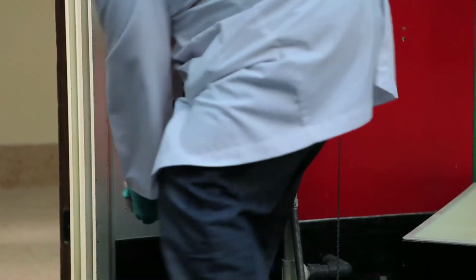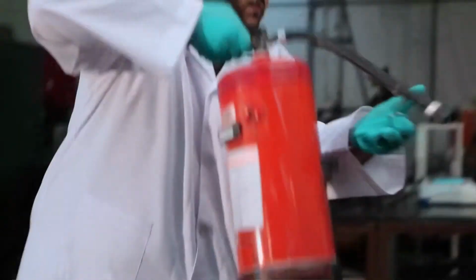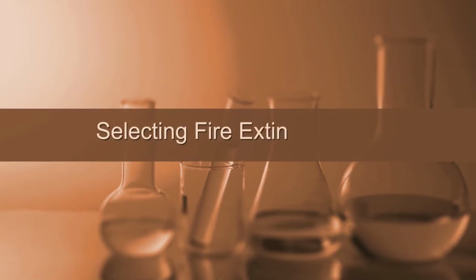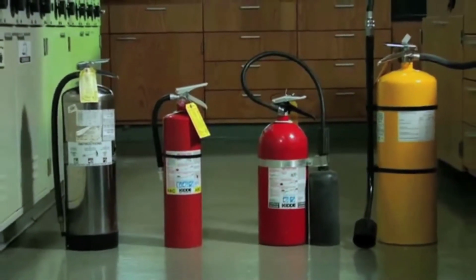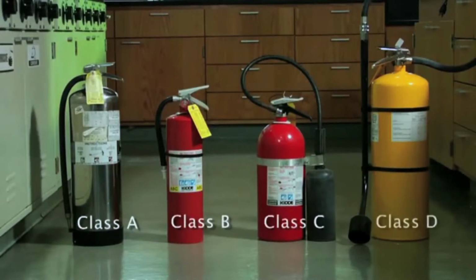Personnel working in lab areas should know how to use and properly identify a fire extinguisher appropriate to the material being handled. Keep your fire extinguisher accessible and clear of obstructions at all times. Know how to select a proper fire extinguisher. Fires are classified according to the material that is burning. The types of fire extinguisher used in a lab are Class A, Class B, Class C, and Class D.